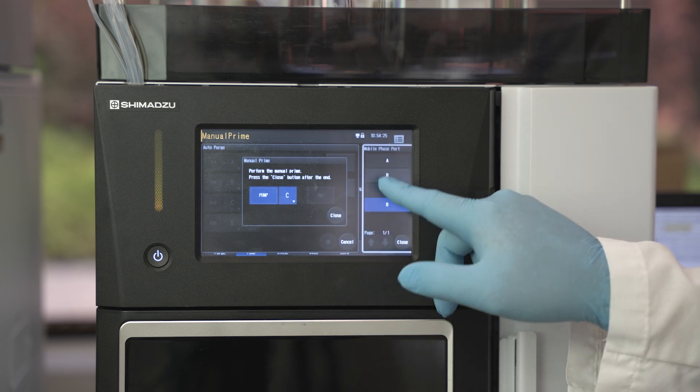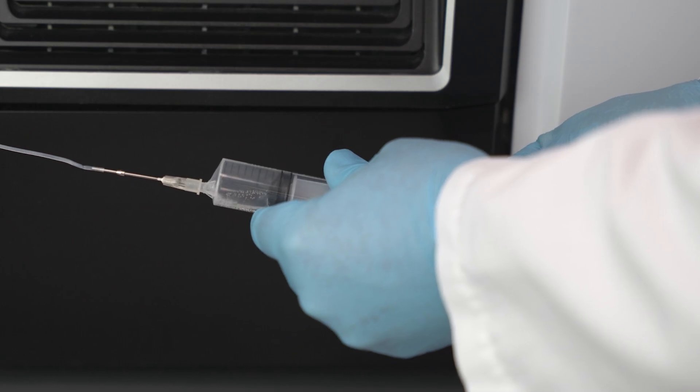Using the touchscreen, click on pump D. Collect 10 to 15 milliliters of mobile phase.